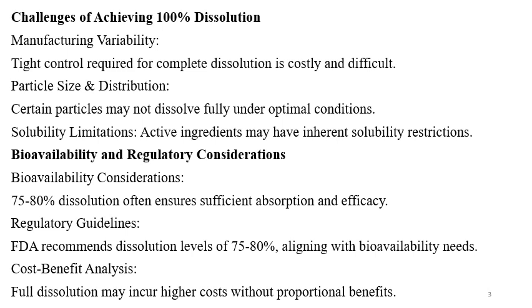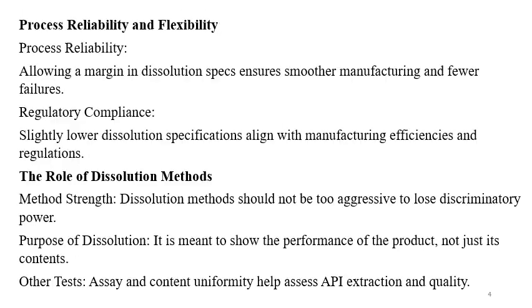Dissolution run for IR tablets is generally for 1 hour or 1.5 hours, sometimes it is 2 hours. And if it is not showing 100% release in 2 hours, for example, then it will go for a longer time. And it is not certain that if you run the dissolution testing for a longer time, it will give you 100% release. So it will add cost and it will not have any benefits.